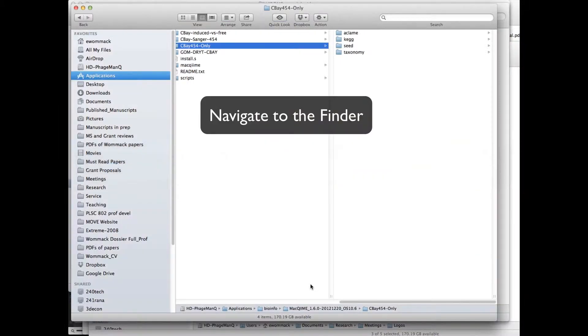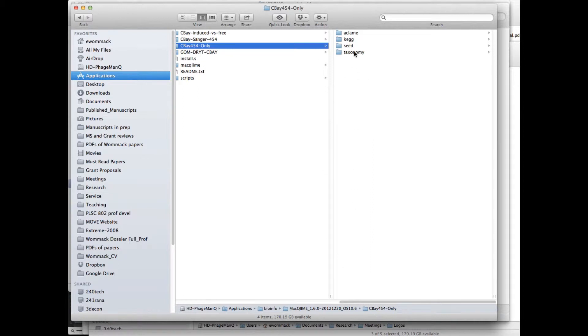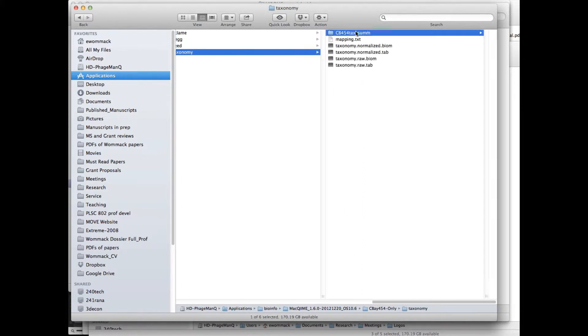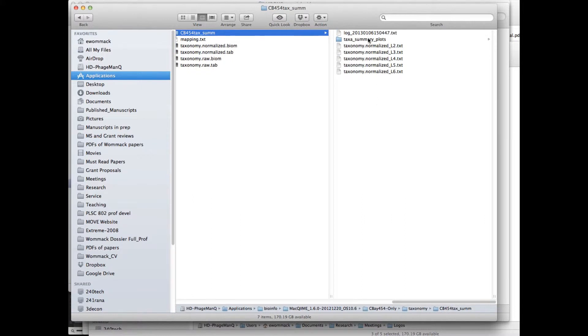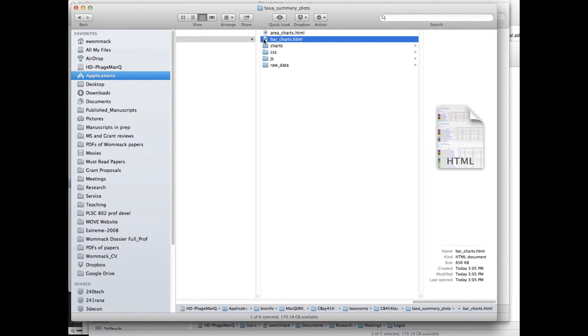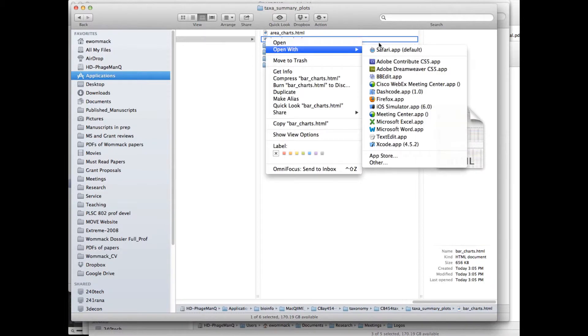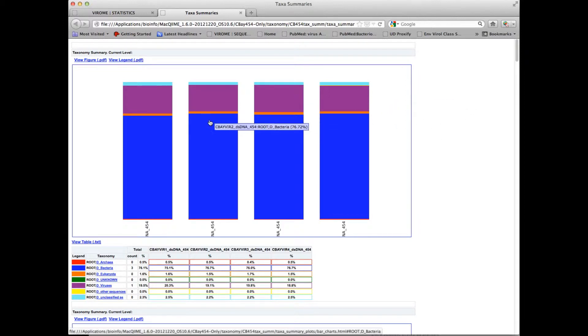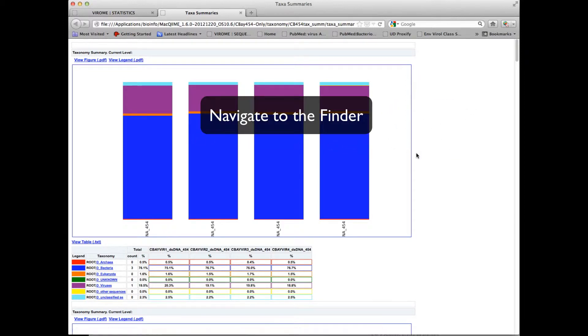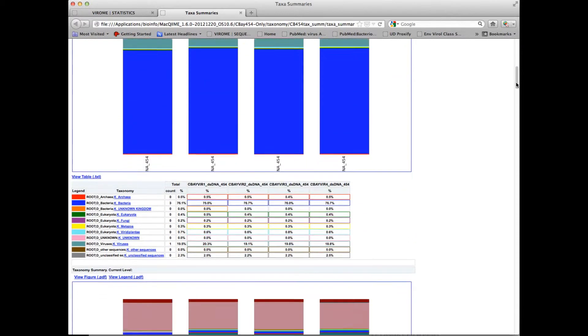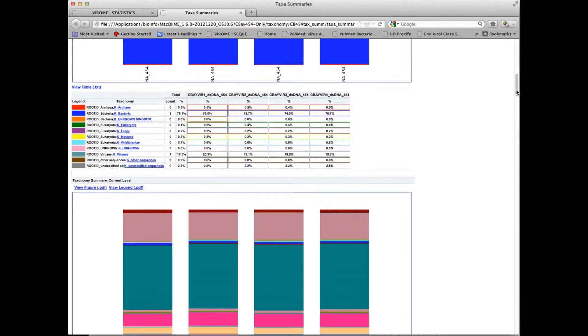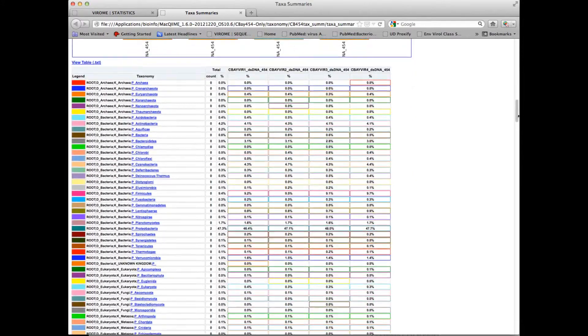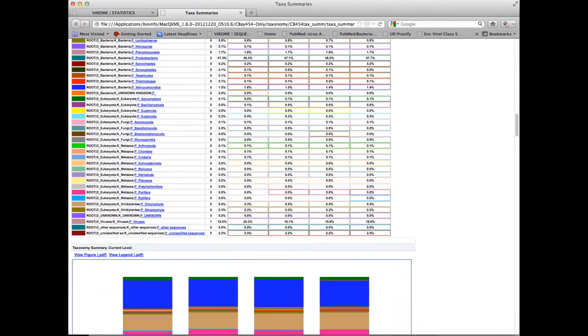Now I can navigate to the finder and look in the taxonomy folder. And there will be this taxonomic summary folder, taxonomic summary plots. And then I can open the bar charts, it's an HTML file. So I'm going to go ahead and open this in Firefox. And here you can see the output, where the four libraries that we just downloaded are compared.